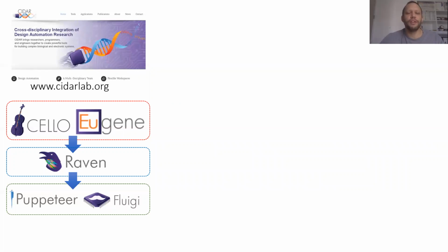But when you've done this in silico, the question then becomes, how are you actually going to fabricate these in the real world? Or how are you actually going to test these in the real world, particularly if you only have a computer science background or do not have an experimental lab? Well, the idea is this would go to the cloud, but the biological cloud.